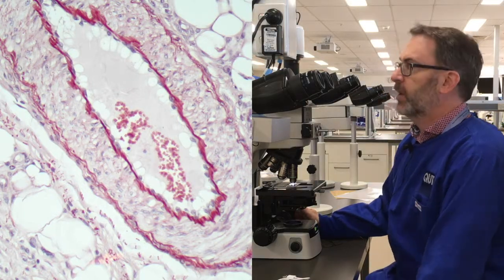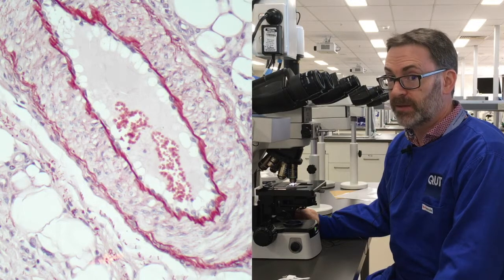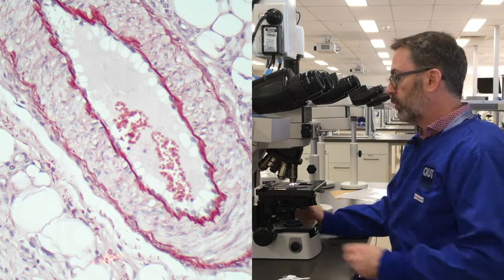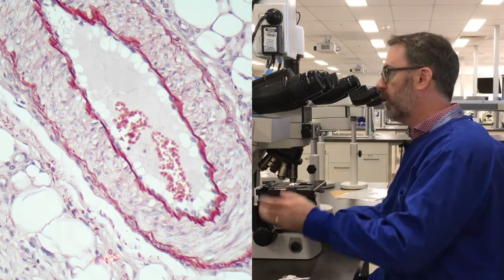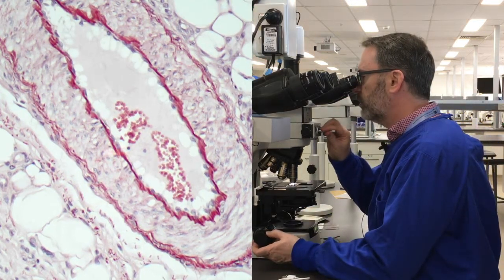Turning our attention to the orcein stain, I actually had a bit of trouble finding an example of bad stains. In fact, most of them were actually pretty good. Let's begin with this slide. This is actually the one that was demonstrated during the orcein staining protocol video. And we can see in the esophagus, deep in the wall, we've got this nice artery here.